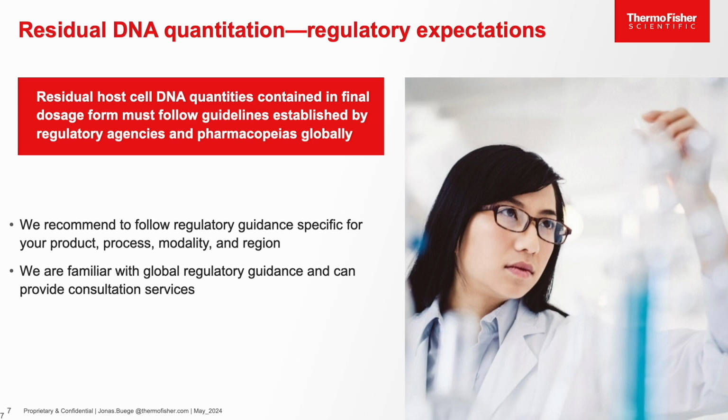Lastly, traditional biologic productions where DNA clearance is extremely well established and also characterized, meeting these regulatory guidances and limits has not been a significant problem, but when you look at viral vector production, this has become an increasing concern, primarily due to potential encapsulation of the residual DNA into the final product.